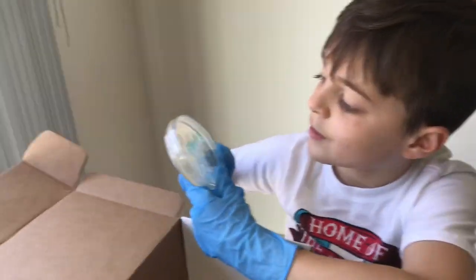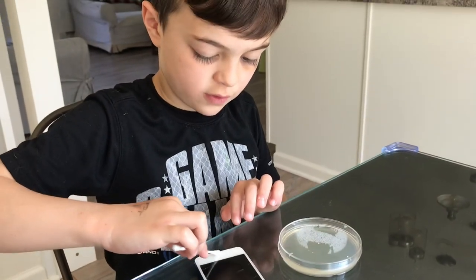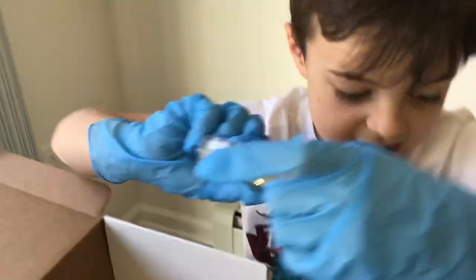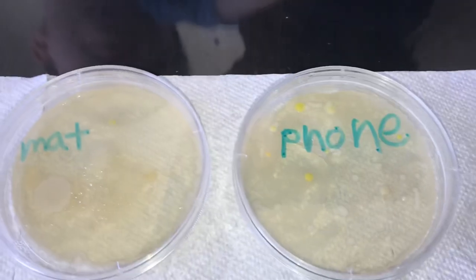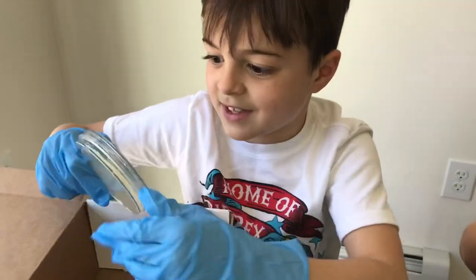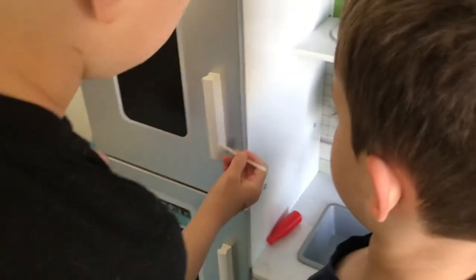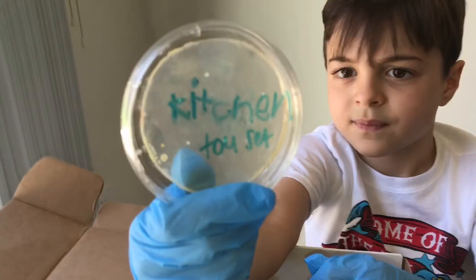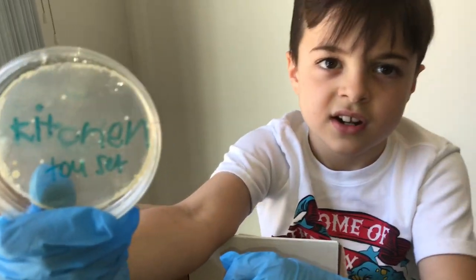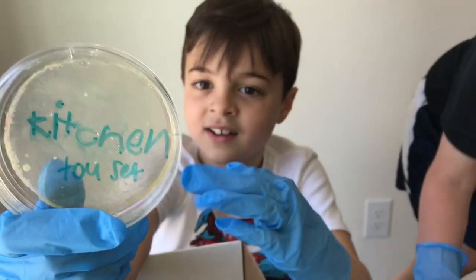What do we have? Phone. Oh, I got some yellow stuff on there. Don't open that, okay? That looks like the worst one so far. Definitely, that's the worst one. Let's move on to the next one — the kitchen set. That looks like the cleanest. That's my toy kitchen. That's not too bad. I'm actually surprised there's anything on it, but we play with it all the time. But we do clean it good. Not too bad, but it is dirty.